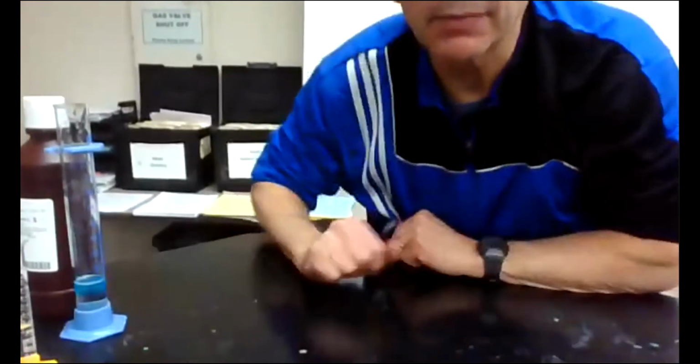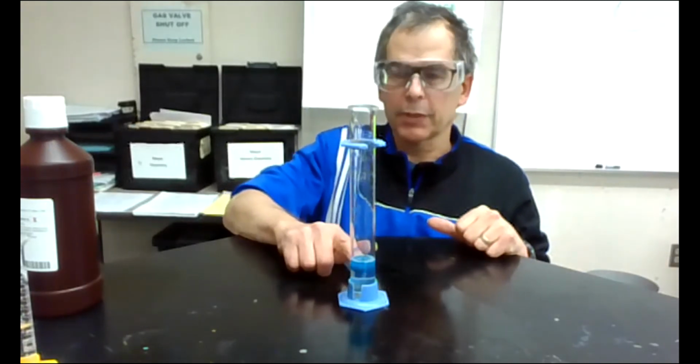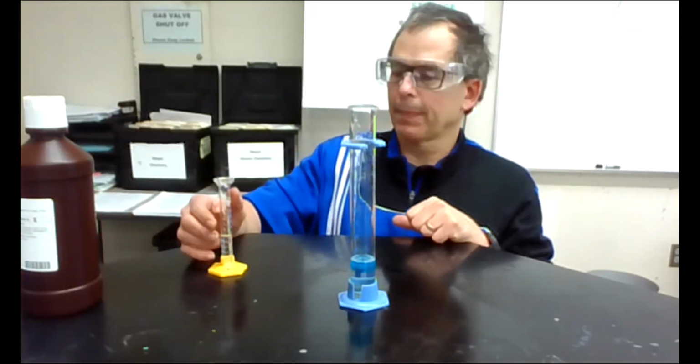The other hydrogen peroxide reaction I have here is sometimes called old foamy or elephant toothpaste. I have 20 milliliters of 30% hydrogen peroxide, and then I put some dish soap above it. Is it reacting? Maybe, but ever so slowly.